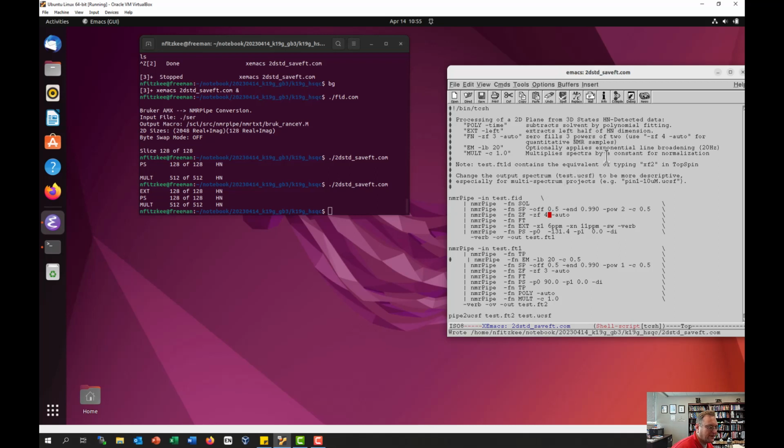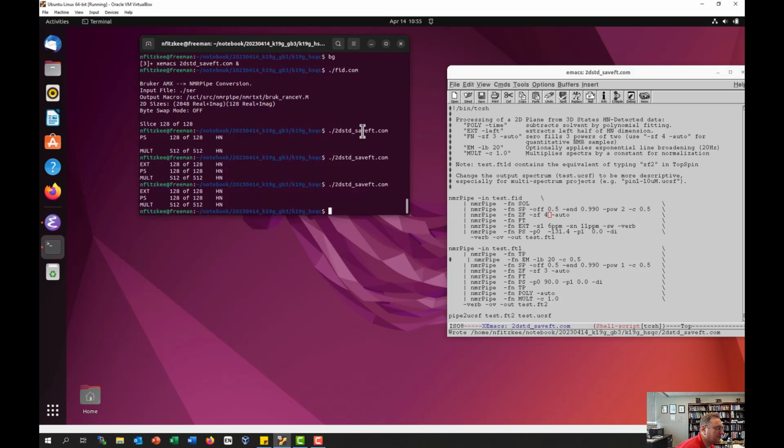There's nothing wrong. The script is not set in stone. You can always edit it and run it again. Hopefully that goes up to, no, never mind. It's still 512. It might be reporting the proton, or the nitrogen, and not the proton. Oh yeah, of course it is.